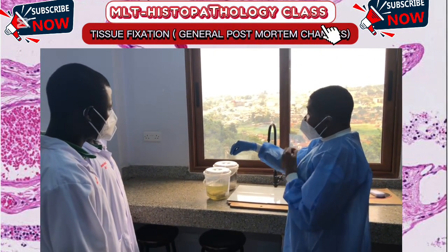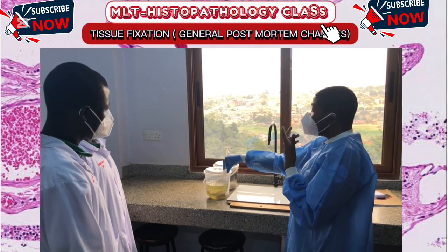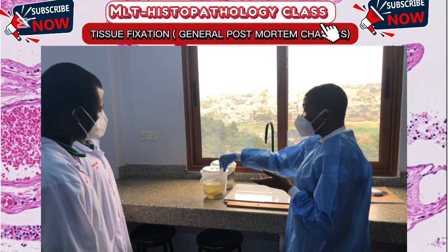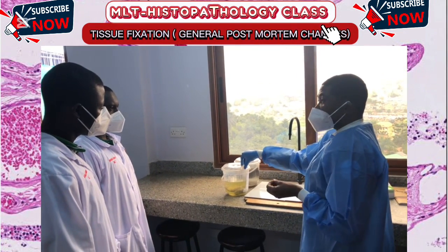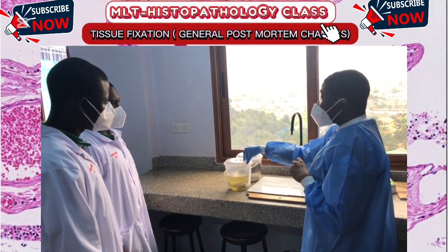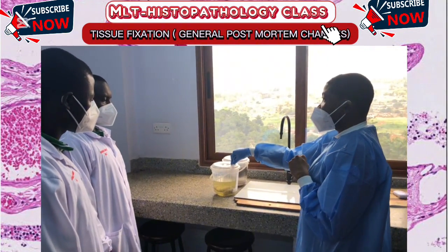So upon blood interruption, it's very important that we immediately fix biological tissues. And commonly we use 10% neutral buffered formalin as a common histological fixative.